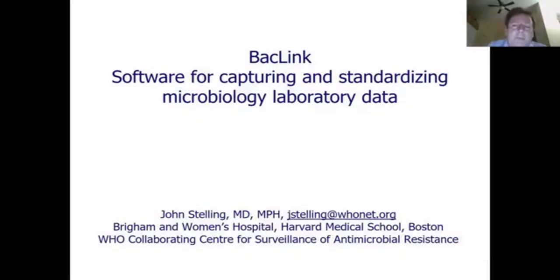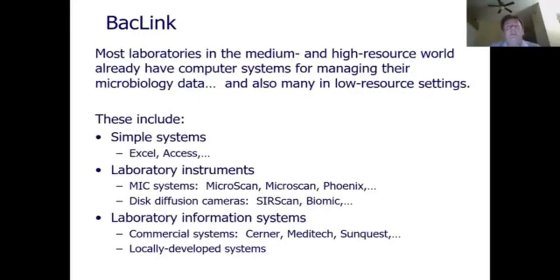I'm not going to give you a demo of BacLink just for lack of time. We ran out of time for sufficient questions on Monday, but I want to make sure that you have an idea of what BacLink is for. So BacLink, as I mentioned, is for capturing existing data. This is an extremely important software because the majority of labs around the world do not manually enter data into WHONET. They already have some system. It might be very basic, it might be very, very complex, but they want to download and standardize their data.